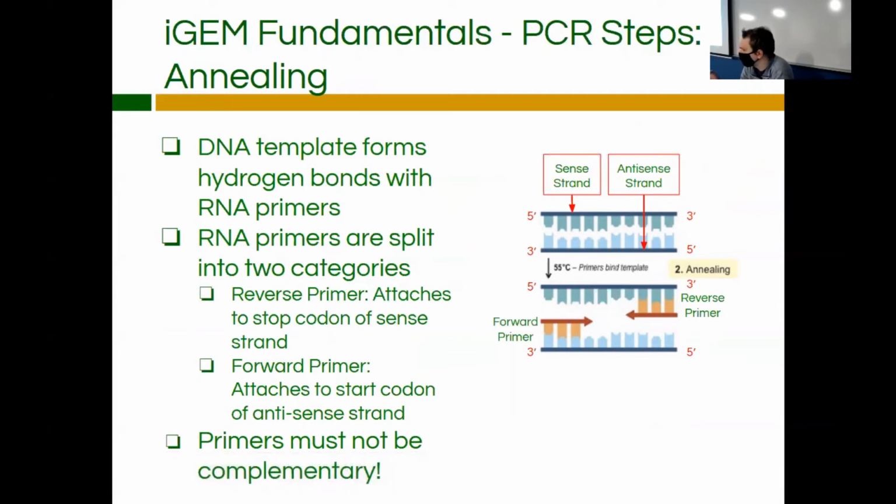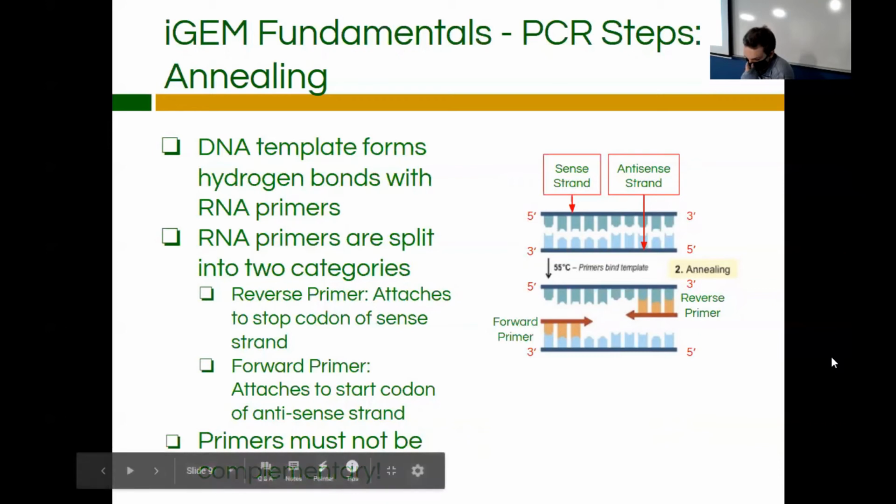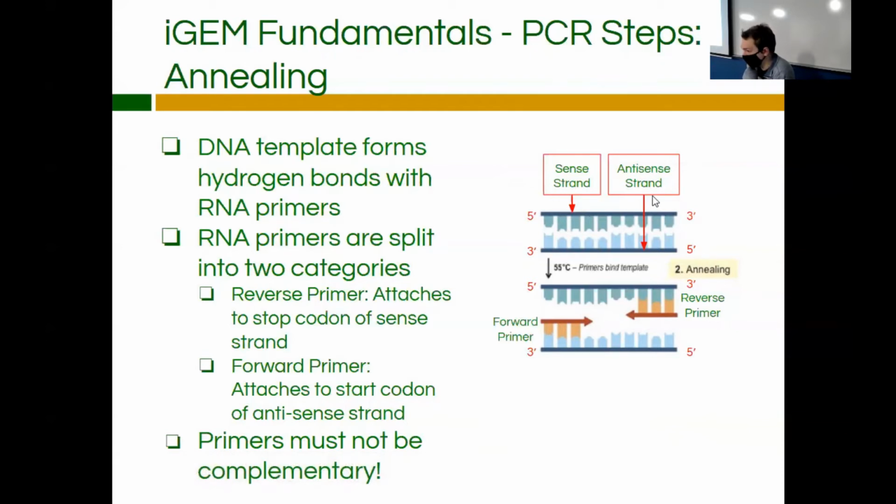I haven't really covered primers at all within these lab committee meetings yet, but pretty much they're little RNA segments that combine or attach to complementary DNA strands. And here, you can see that the DNA is segmented, your sense strand and antisense strand, 5', 3', 5', 3', like typical DNA. And your annealing takes place at 55 degrees Celsius, where the reverse primer, right here, attaches to the stop codon of the sense strand.